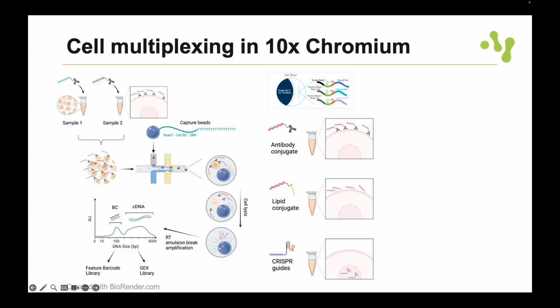I think there's 96-plex, right? Yes, because I'm remembering from some of their presentations that they have a limit on the multiplexing that can be done based on the antibody conjugations. So, for example, I can't multiplex 96 samples with different... no, I think it's different. Oh, you're thinking about the ADT when you're doing detection of different proteins with antibodies, perhaps?